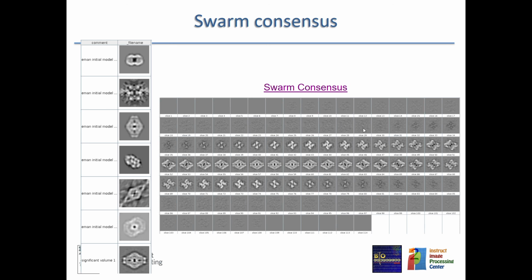As you can see, some of the maxima have been more successful. This maximum was not very successful, and most of the particles are getting to here, but some of them got trapped into this local maximum. And then eventually, because in the swarm there is a crosstalk of information between individuals, these individuals realize that these ones are in a better position, and they start moving towards the correct maximum.